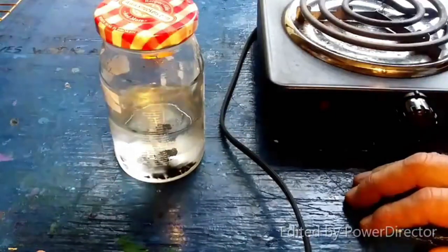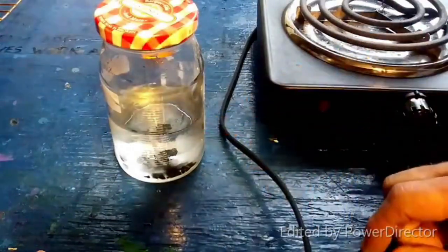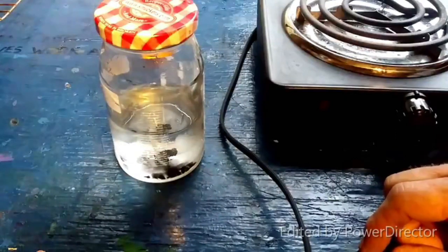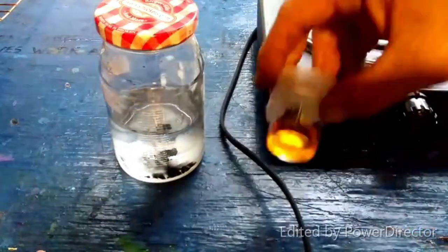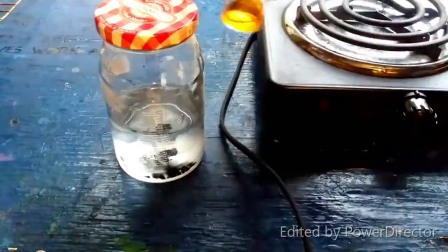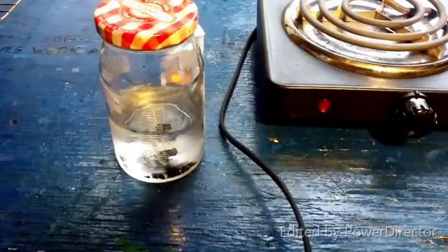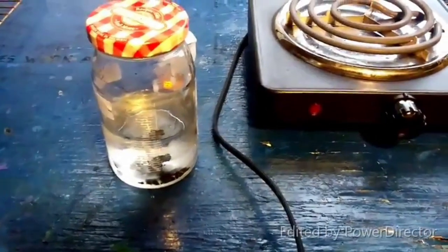So, cool. I will put the filtrate here in cesium recycling, and we'll use the platinum for another experiment. We'll need to, because we're running out of solution here. After that being so successful, I have to report a failure. Kind of.